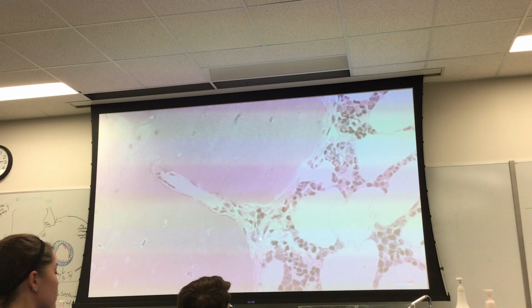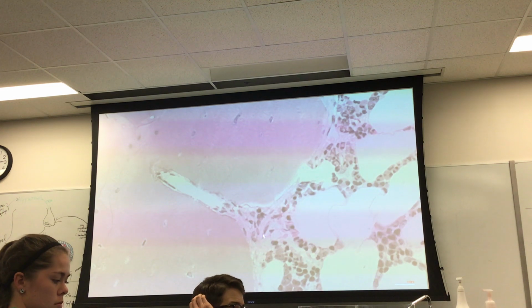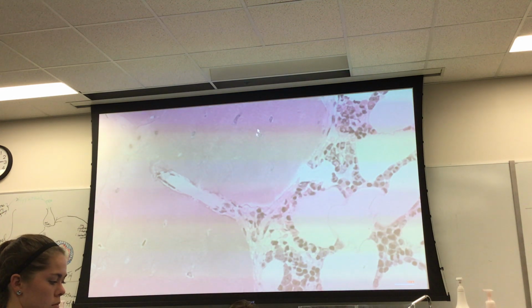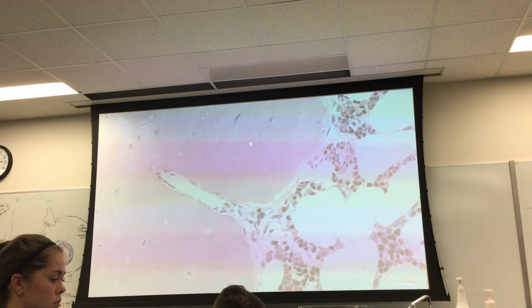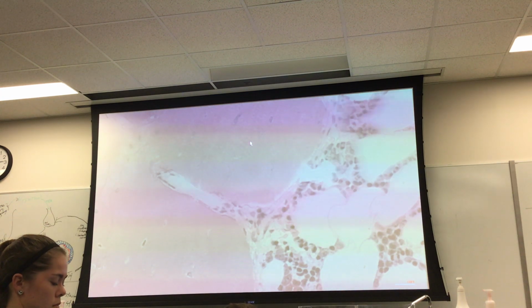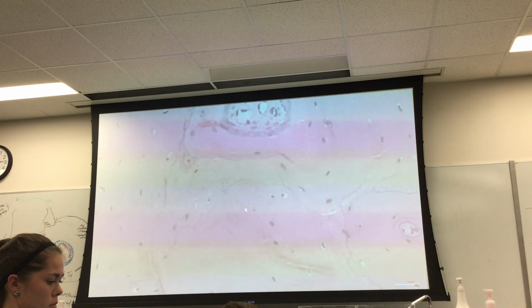All right. It's hard to visualize these things, but remember the diaphysis of a bone is essentially inner circumferential lamellae, that's what these guys would be. Outer circumferential lamellae, that's what's deep to the periosteum. And then what you have is in the middle of the bone cortex, where all the haversian systems are, stuff that's in between adjacent haversian systems. Again, it's called interstitial lamellae, like that would be this right here, versus the ones that make up haversian systems, like this one right here. Those are called concentric.